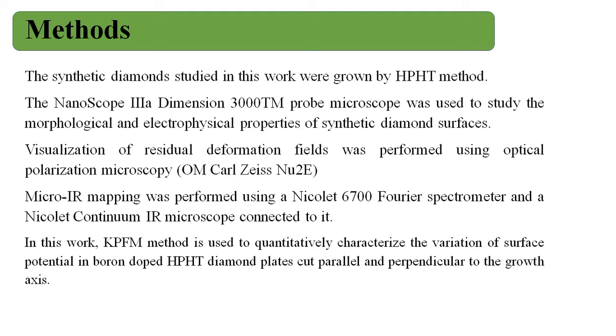The Nanoscope 3A probe microscope was used to study the morphological and electrophysical properties of synthetic diamond surfaces. Visualization of residual deformation fields was performed using optical polarization microscopy. Micro-IR mapping was performed using a Nicolet Fourier spectrometer and a Nicolet Continuum IR microscope connected to it.